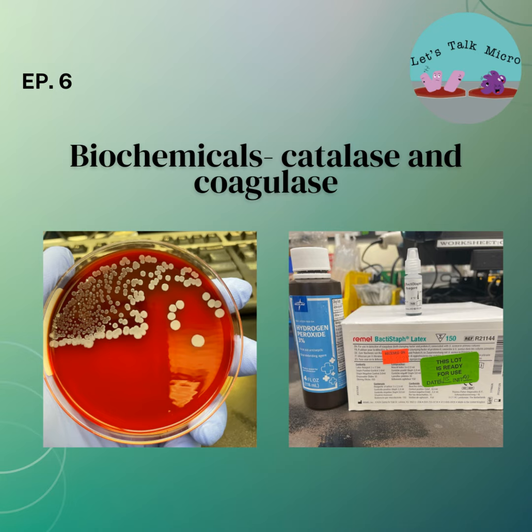That's one of their trademarks. Another example is catalase. Staphylococcus species are catalase positive. So sometimes, the biochemical reactions can be enough to identify certain organisms, as long as some conditions are met. And this is what we call a presumptive ID, but I will talk about this in another episode.